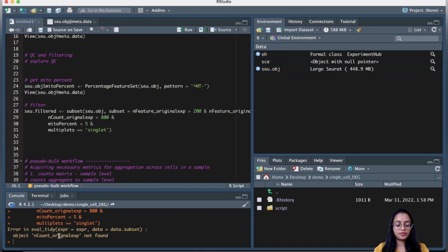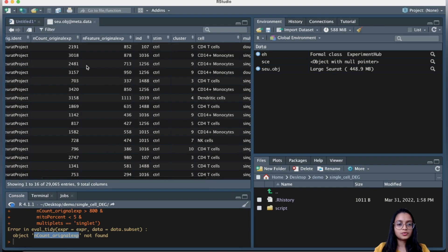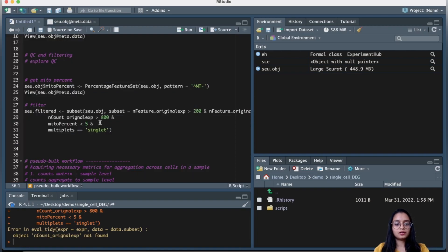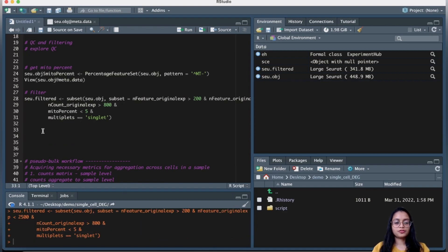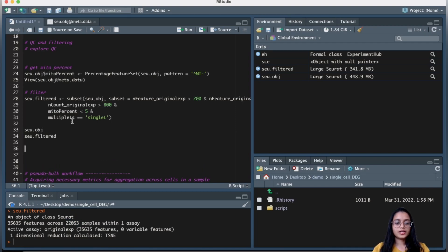I got an error saying nCount_originalexperiment was not found — I had misspelled the column name. After fixing it to the correct column name and re-running, the filtering completed successfully. We started with around 29,000 cells and after filtering we are left with around 22,000 cells.